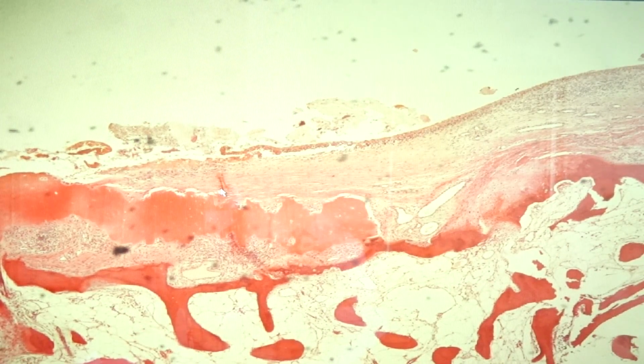Next, we go to slide 196, which is rheumatoid arthritis. Okay, so rheumatoid arthritis is an autoimmune disorder or autoimmune disease, which we would see in the joint. And this would also cause destruction of the articular cartilage as well as that of the bone. And it can cause the formation of a fusion of joint surfaces, which we would call ankylosis. Aside from joint lesions, we also see skin lesions, heart lesions, blood vessels, and lungs would be affected.